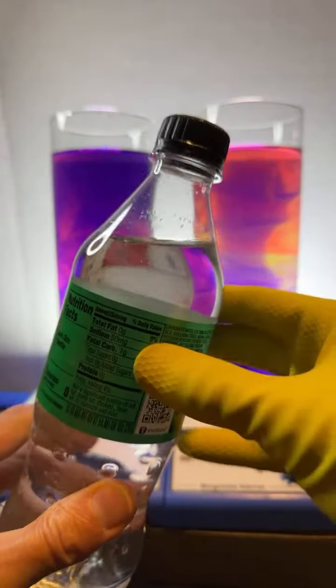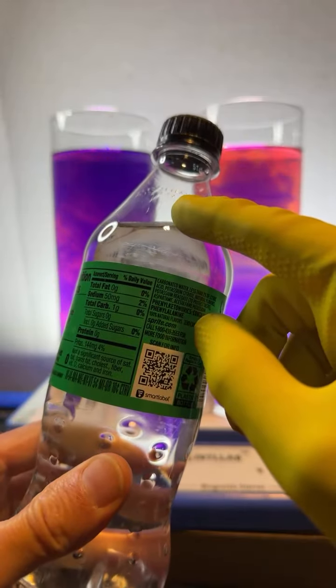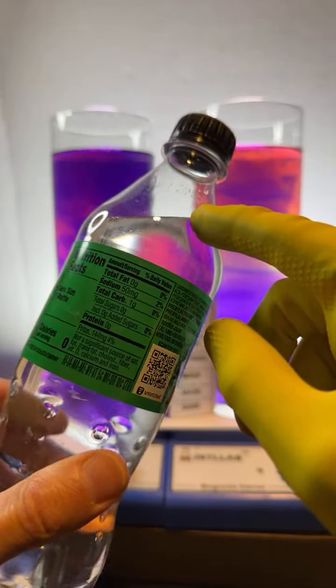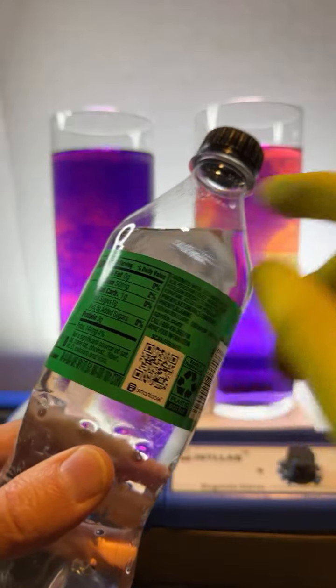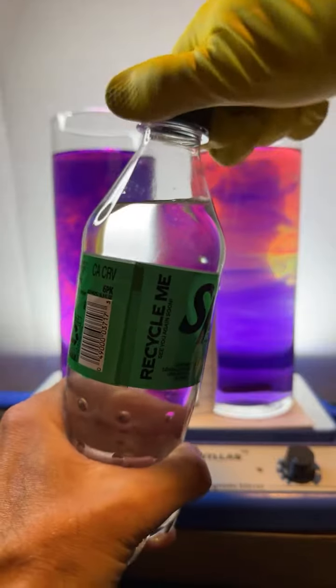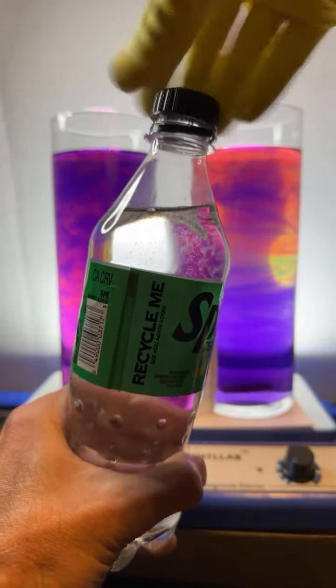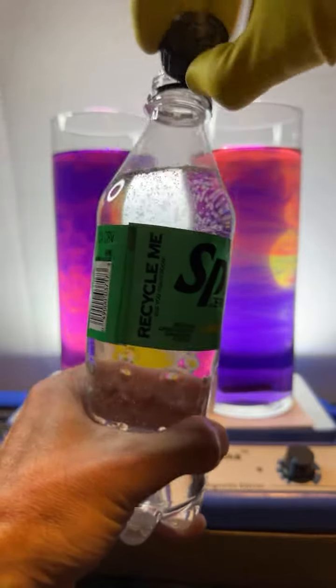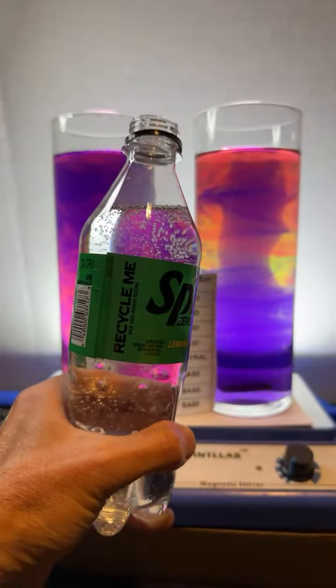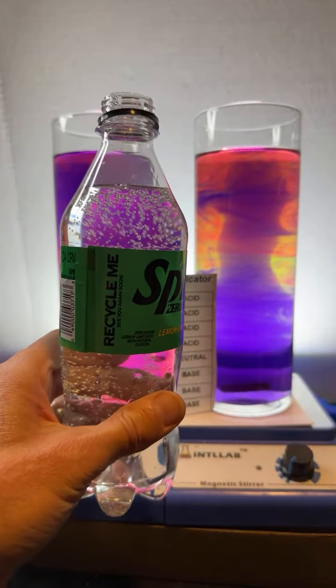Can you see its expiration date? I can't quite find it, but anyway, it's pretty old, but nevertheless, here we go. I'm going to open the Sprite. There it goes. Crack open the lid. See the bubbles forming. Let's add some universal indicator to this.